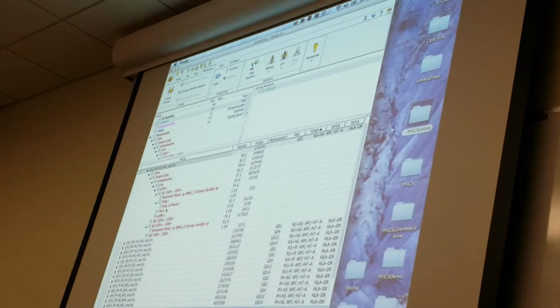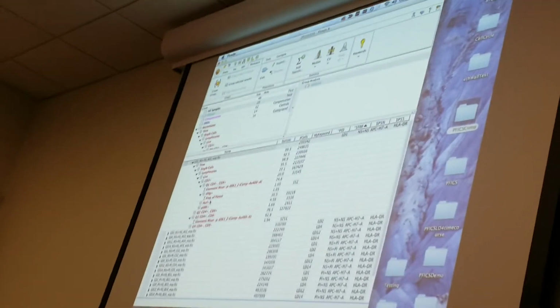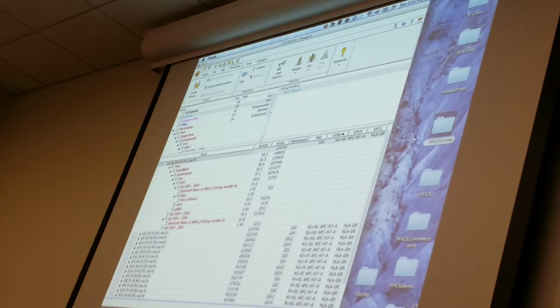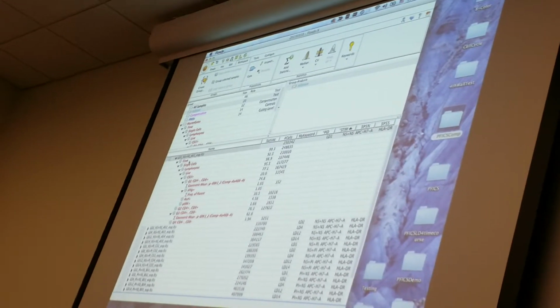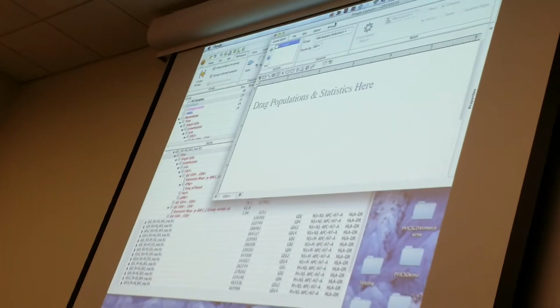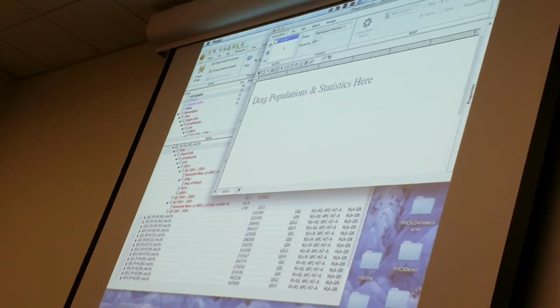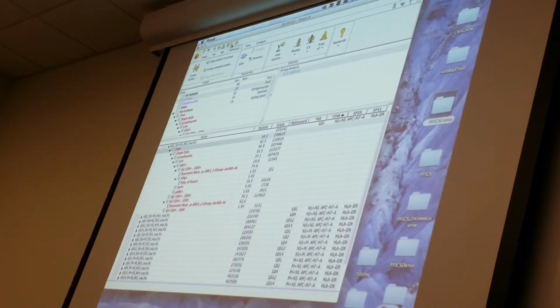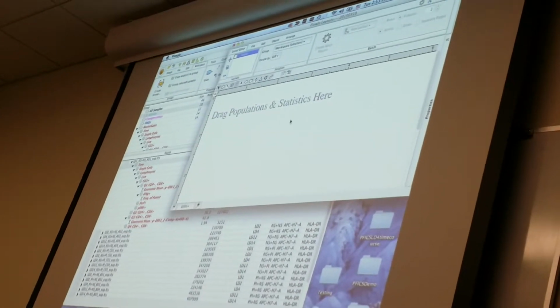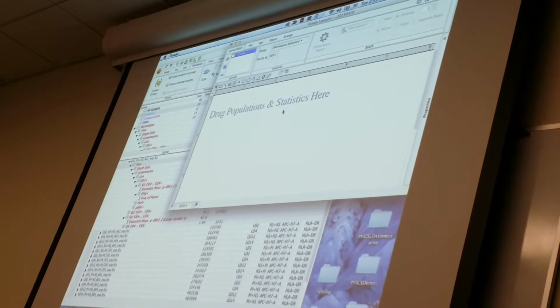We had to actually get our gates approved by the coordinator and the assistant director to move forward with exporting statistics for our PIs that were doing the project. So we start by making a basic gating layout, and in this case I'm going to open the layout editor by clicking on the icon. It gives me a new window, and then I'm going to drag populations and statistics here.